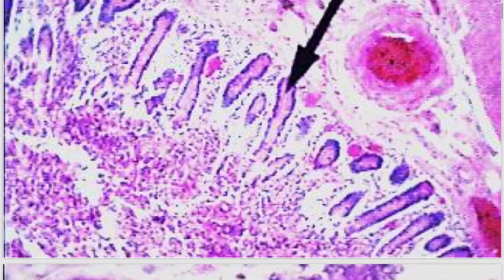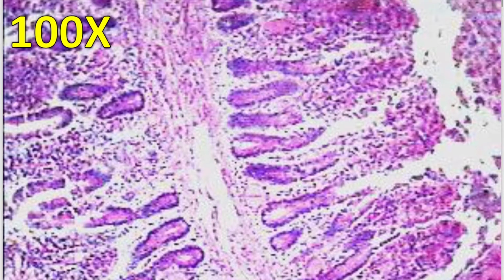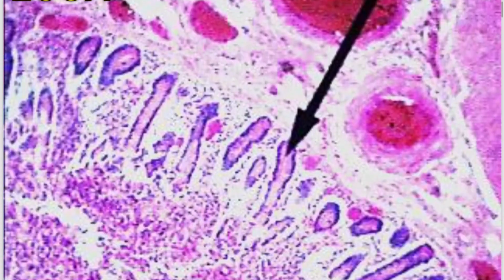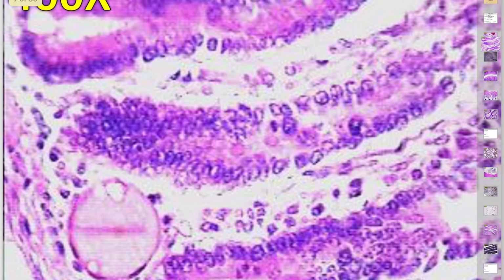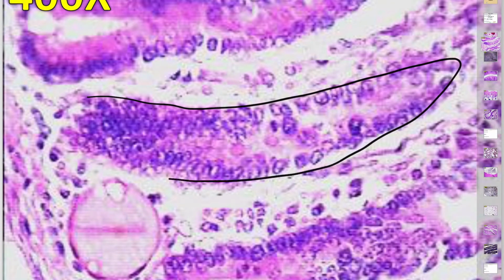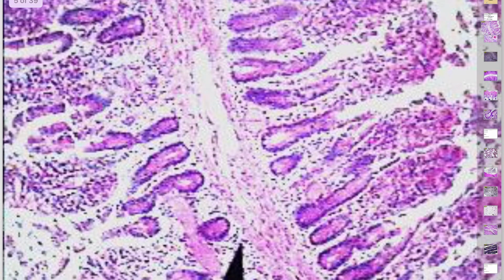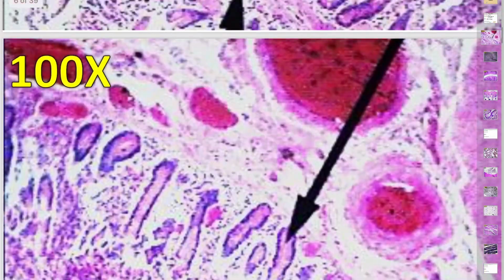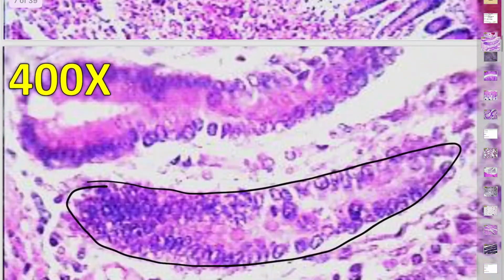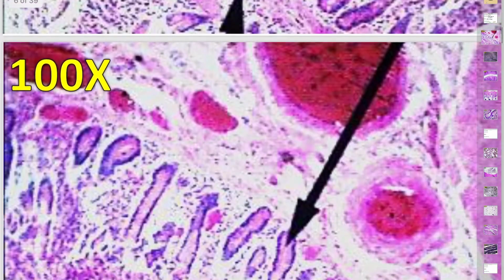So we're going to move to the second flashcard here, and you're going to notice this is the one that I believe you have a flashcard of, at 100 times. This one's at 100 times too. It looks similar, a little bit different. And this one you'll notice is zoomed way in. So what you're seeing here with this cell, this is a single cell that you're also seeing right here. That might even be the exact one. Yeah, it is, because I can see that bubble.